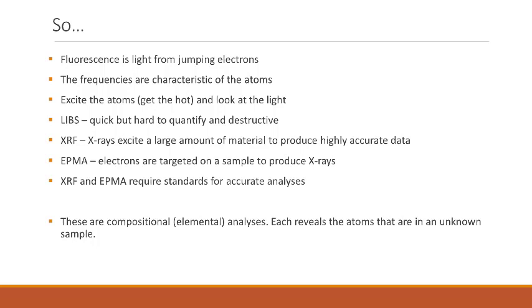It does nothing for polymorphs, right? Because polymorphs have the same composition, but it will tell you what elements are present and which polymorphic set you should be looking at.